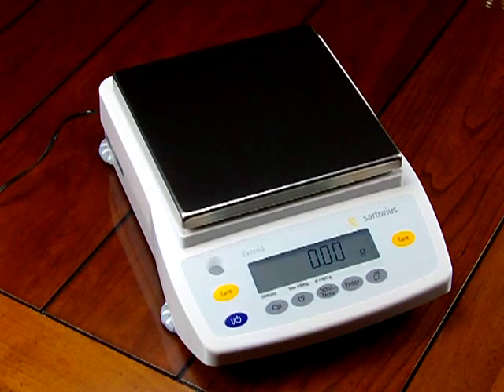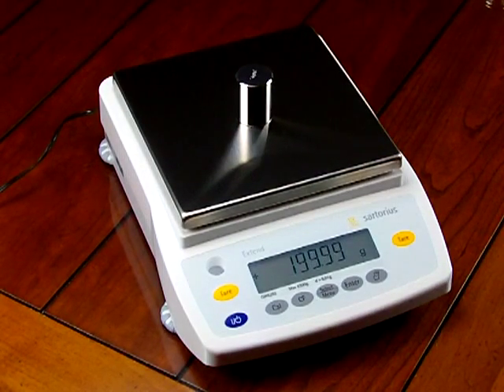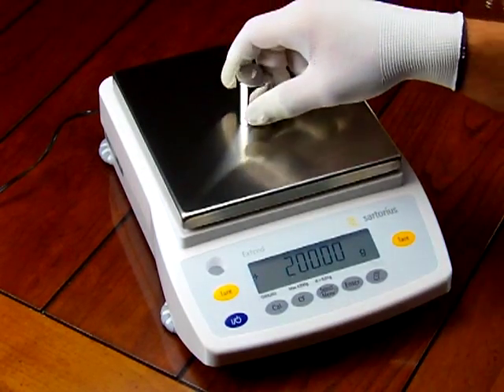We are Precision Weigh-In Balances. We're an authorized Sartorius dealer and we'd like to show you the Sartorius GW6202. A lot of people call us asking what is the best 0.1 gram precision balance that you have to offer, and hopefully this video will answer those questions. The Sartorius GW6202 offers 6200 grams by 0.1 gram readability.